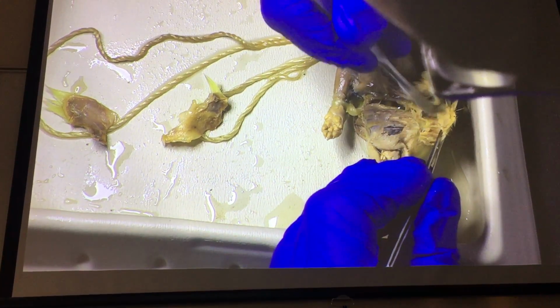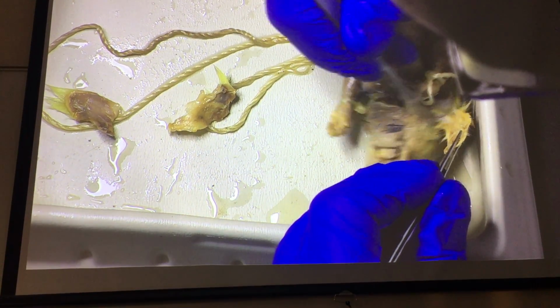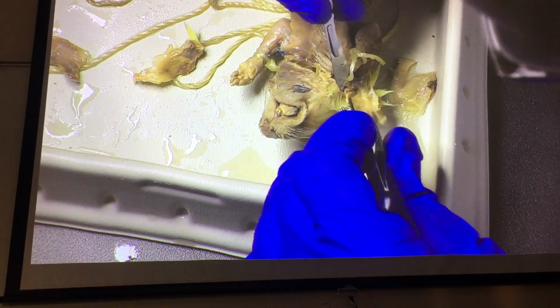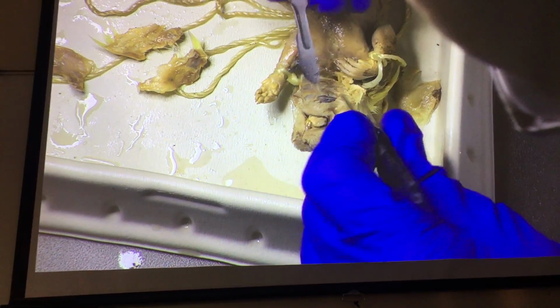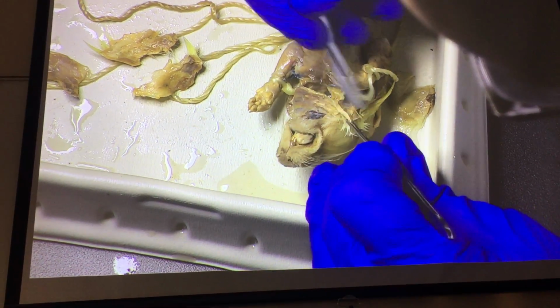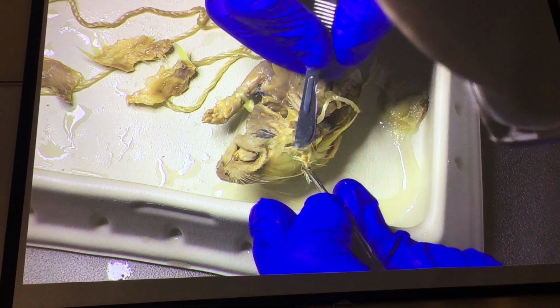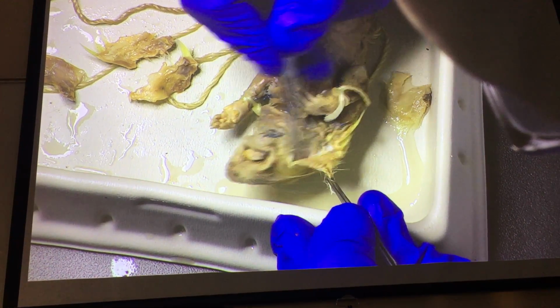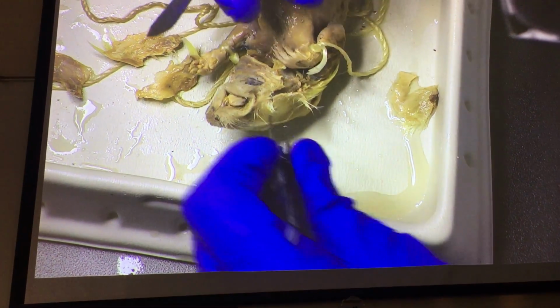The other difference, and this is the one I know Amanda knows, is the masseter. The masseter has 3 different muscles in rodents. We have the lateral masseter, the medial masseter, and the superficial masseter. You're not going to have to tell them apart, but the masseter has 3 different portions that, depending on how the animal chews, are differential in their development over evolutionary time.